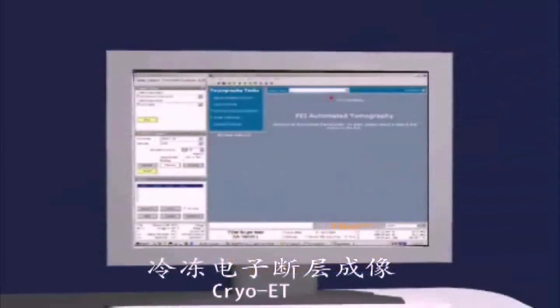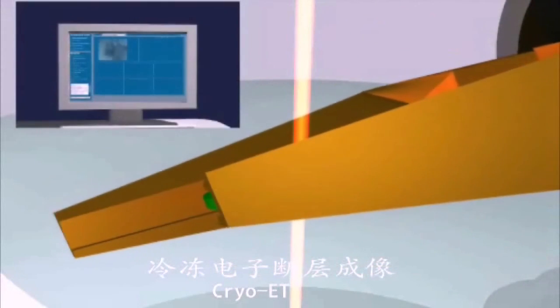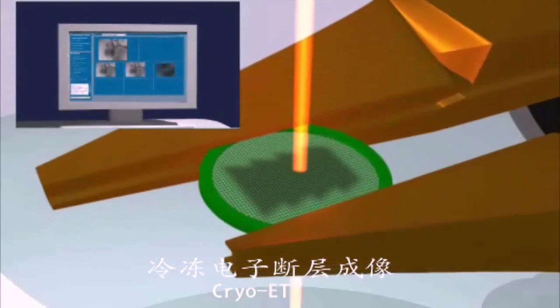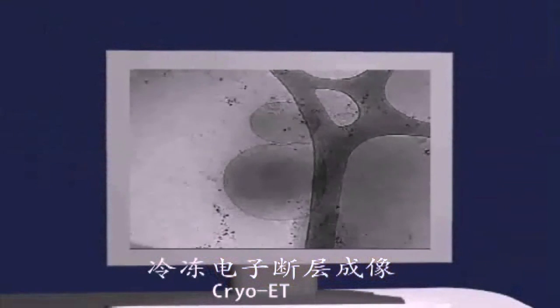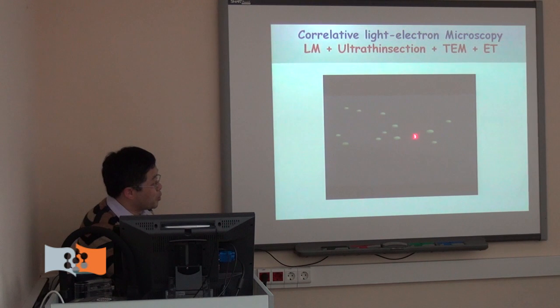This is an EM grid. Now this is computer controlled. You can do electron tomography, tilting them in different angles. Then you get projection images at different angles, and do the 3D reconstruction, trying to localize your molecules.